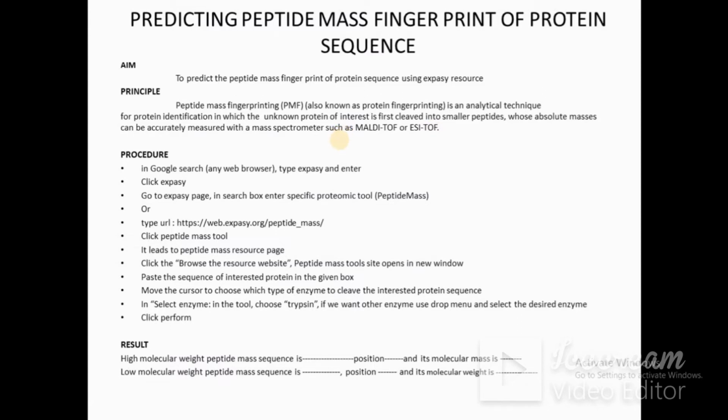So peptide mass means we cleave the protein sequence, which can be taken from Swiss-Prot or be a user-entered protein sequence. Then we cleave this protein sequence with our chosen enzyme and compute the masses of the generated peptides. The tool also returns the theoretical isoelectric point and mass values of the protein of interest. If desired, PeptideMass can return the masses of peptides known to carry post-translational modifications.